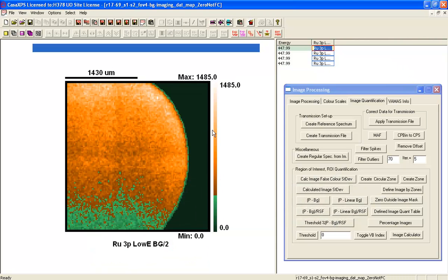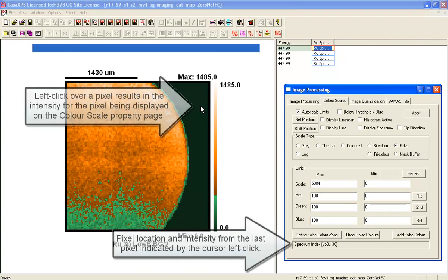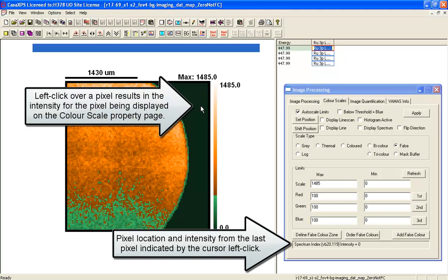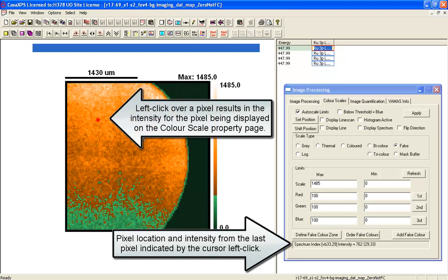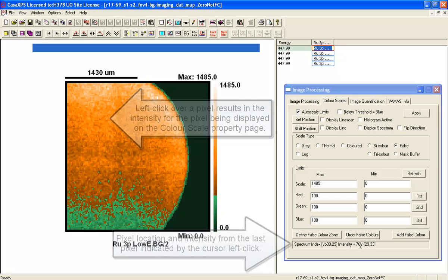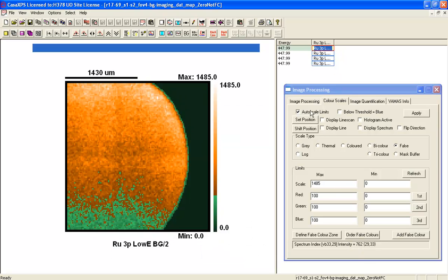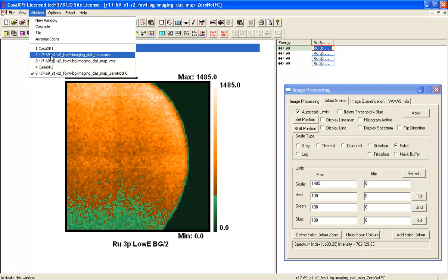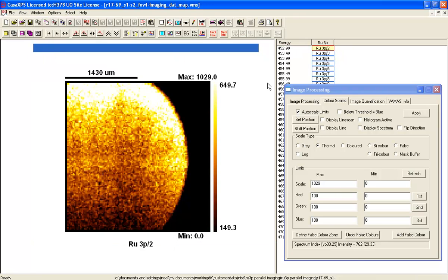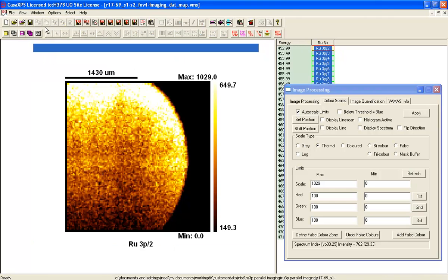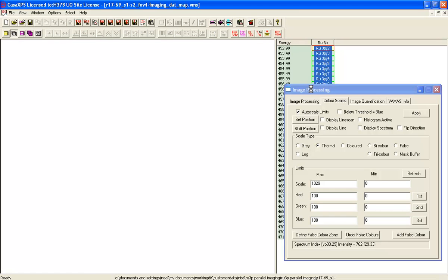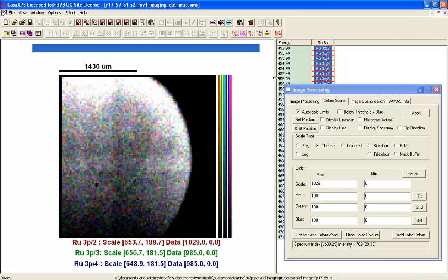And these now are set so that when I click inside here, you can see the intensity is set to zero, whereas when I click where the color was defined, it's got intensities. So we can do the same for another set of images that were acquired over a range of energies.